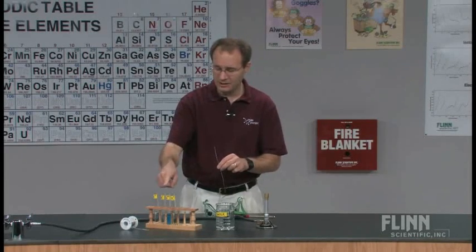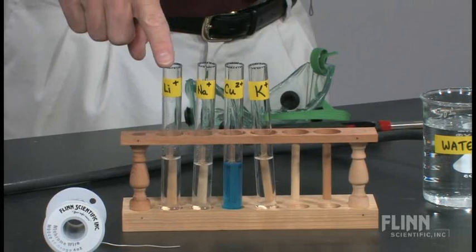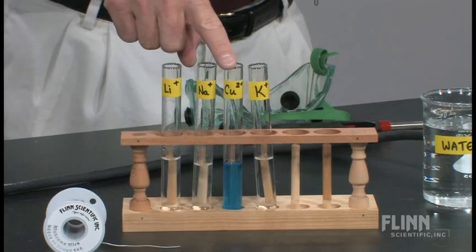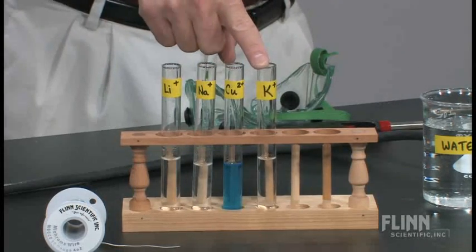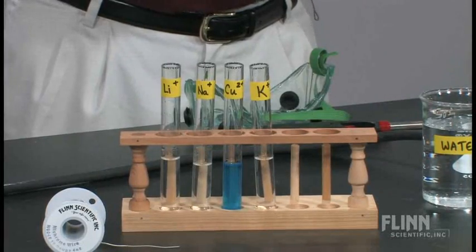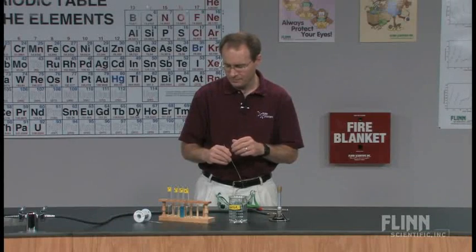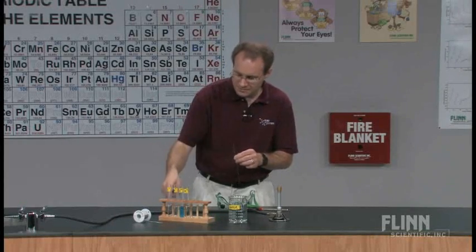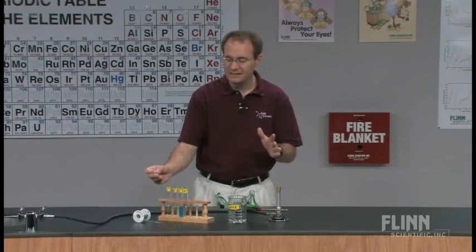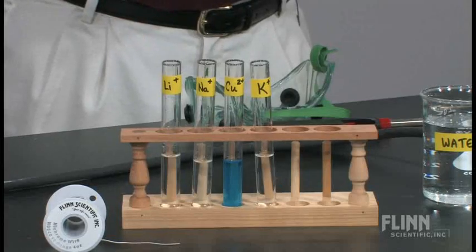What I have here are test tubes containing a lithium solution, a sodium solution, a copper(2+) solution, and a potassium solution. We typically use a one molar solution, but the concentration isn't that important. The amount in the test tubes is more than enough — probably fifteen classes could use this amount of solution.